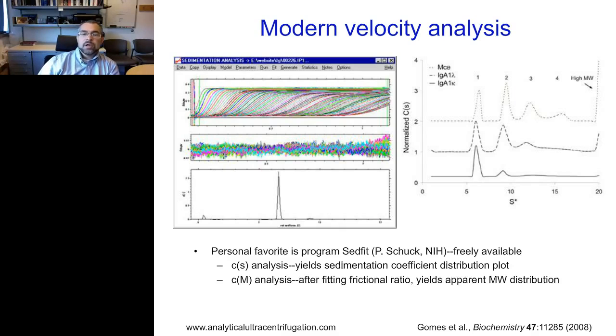So the primary parameter we're looking at here is the sedimentation coefficient. That is related to how fast something will sediment through solution. It is measured in terms of Svedberg units, so many S. So for example, in this plot here, this shows you 3 different samples of IgA, the antibody that was purified from serum from myeloma patients.